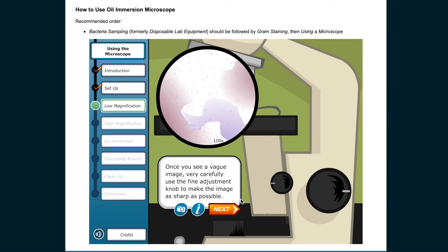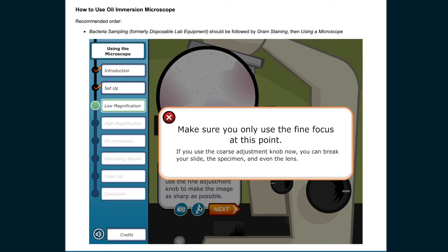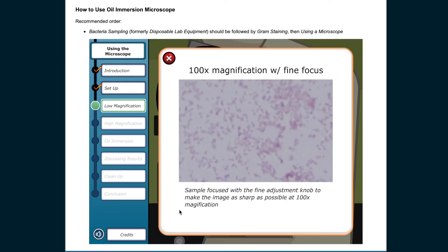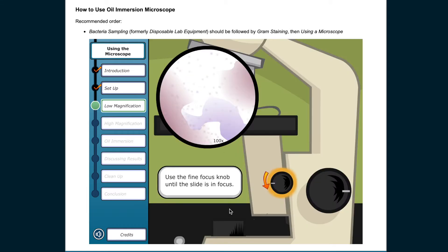Once you see a vague image, very carefully use the fine adjustment knob to make the image as sharp as possible. Make sure you only use the fine focus at this point. If you use the coarse adjustment knob now, you can break your slide, the specimen, and even the lens. Use the fine focus knob until the slide is in focus.